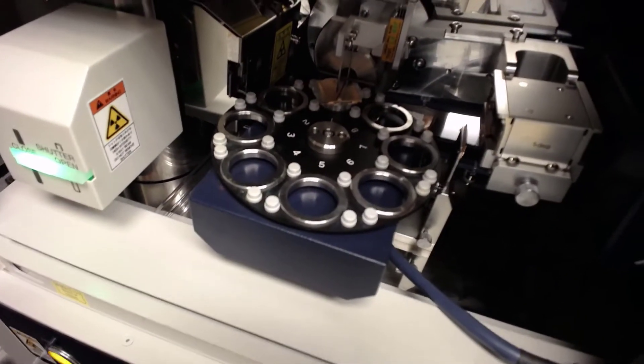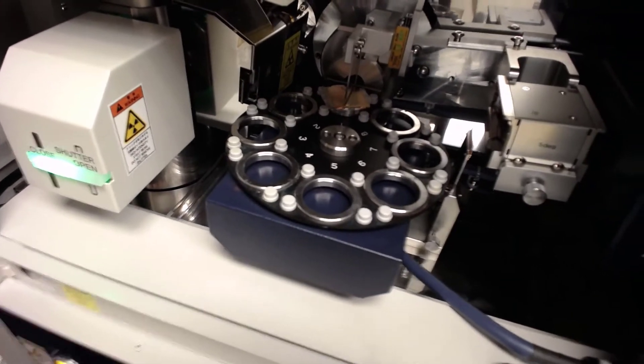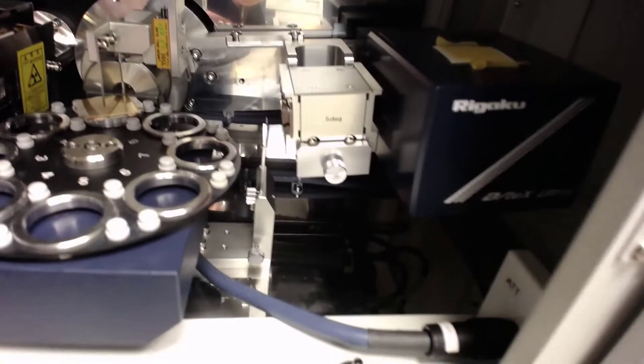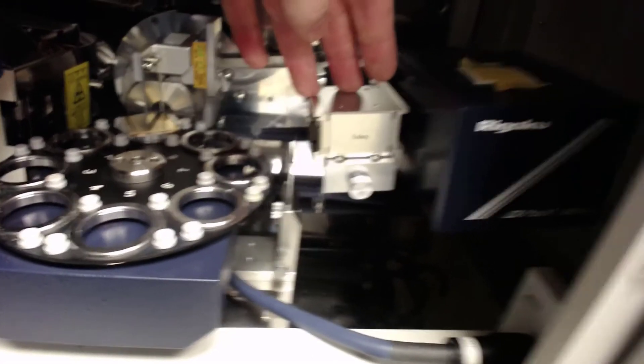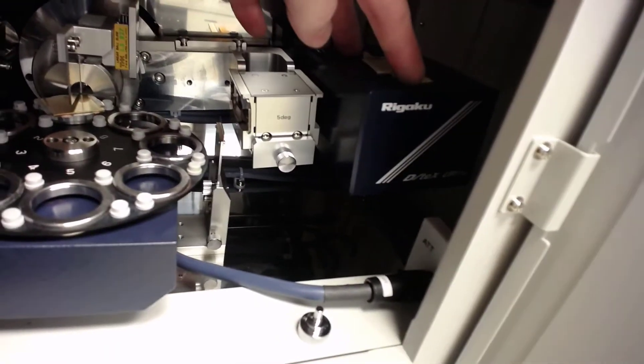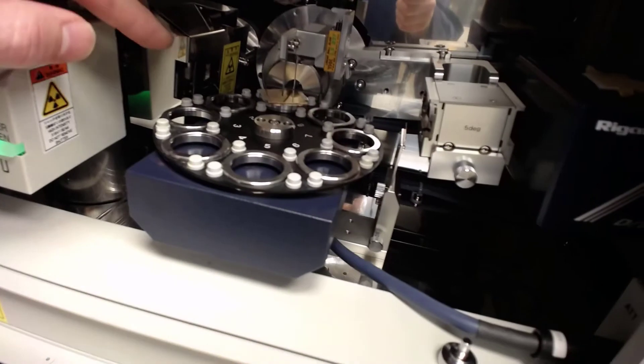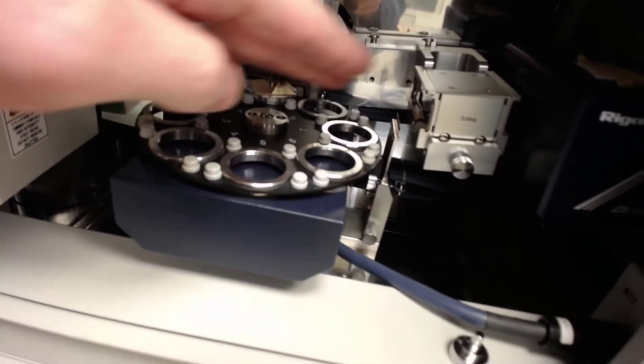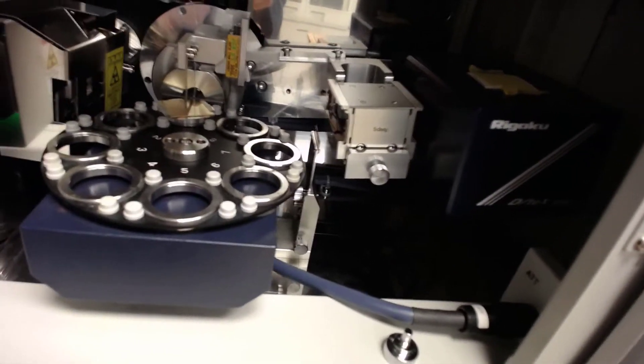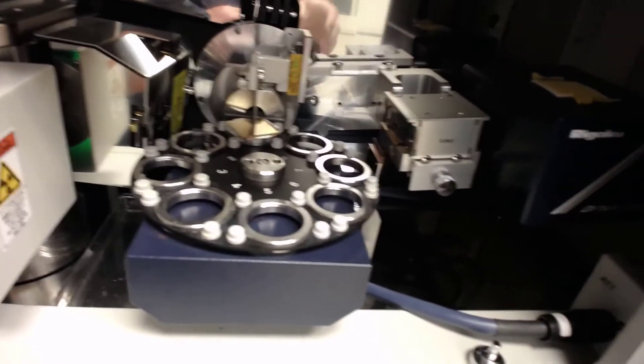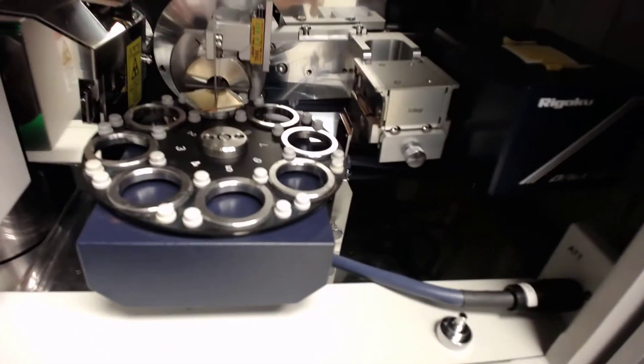In the middle you can see our 8-position auto sample carousel. And then on the right we go on to another set of slits and the detector is over here. So the X-rays will come out, diffract off the sample, and go to the detector for counting how many X-rays were diffracted.